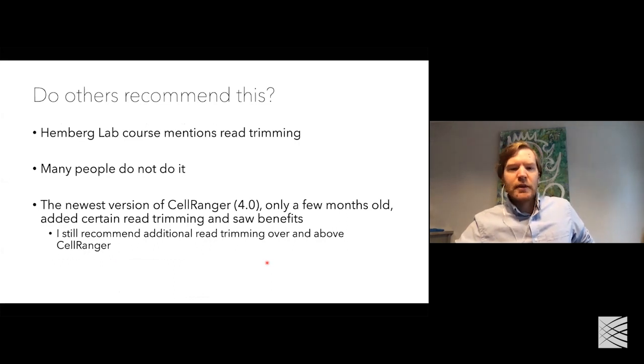Do others recommend this? The Hemberg Lab course that I mentioned at the beginning does mention read trimming, but many people in practice who I've talked to, many papers that you see in the literature, they don't mention read trimming. A lot of people don't do it, but I would very strongly recommend it.